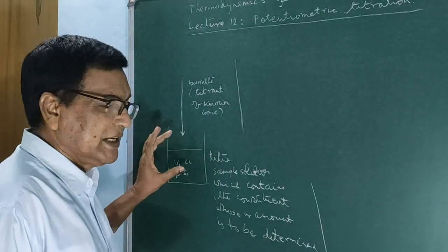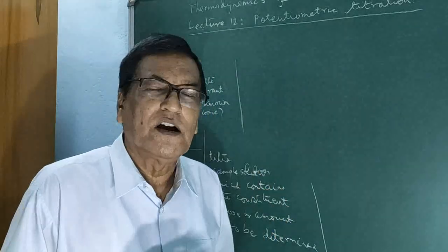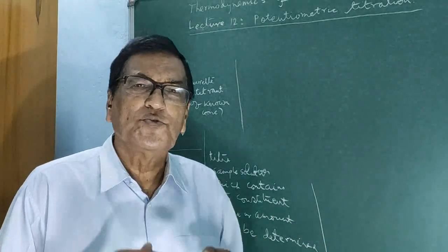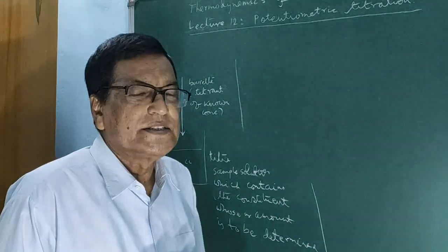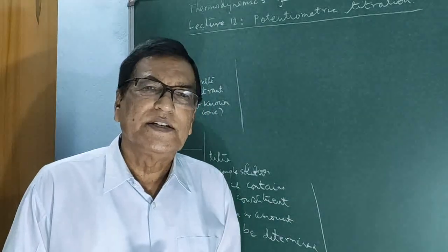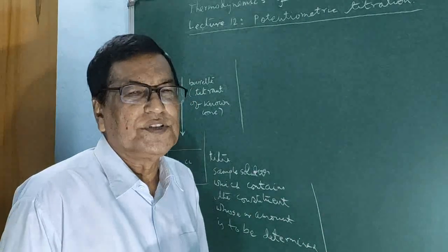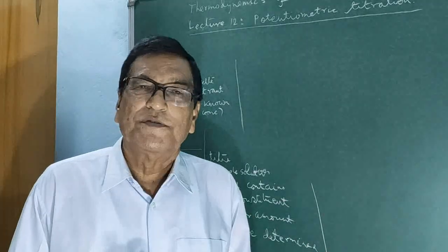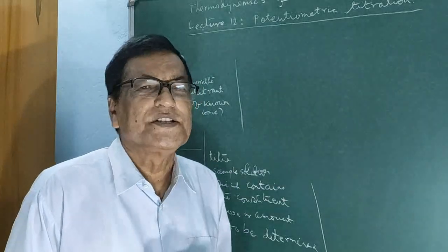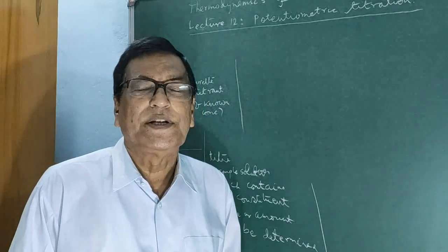Since the potential of a single electrode is not determined, we have to couple this indicator electrode with a standard secondary electrode whose potential will not change in the course of the titration. Then we get a cell, and the cell potential is determined by means of a potentiometer, or in some cases an electrometer or vacuum tube potentiometer.